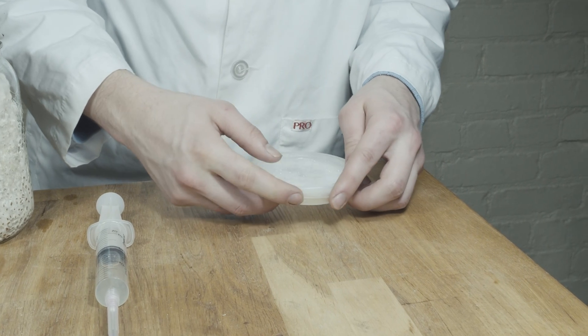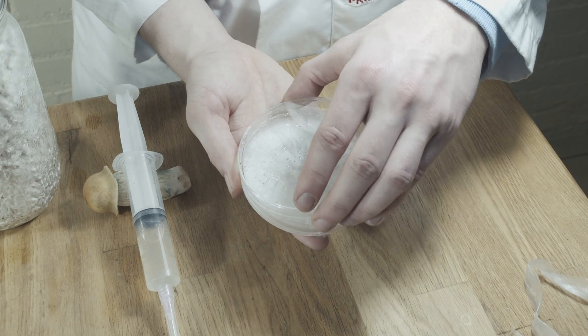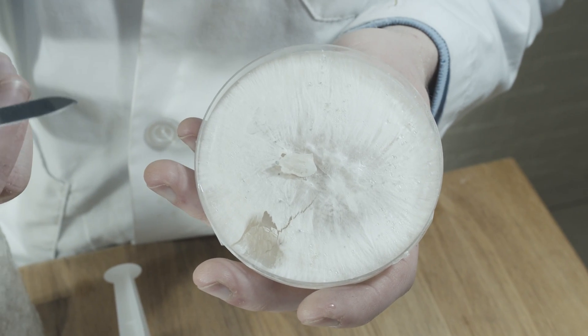Tissue from a mushroom or spores are placed on an agar plate and the mycelium is allowed to grow. The best section of mycelium is transferred to a clean agar plate. This is repeated until a clean single culture is isolated.